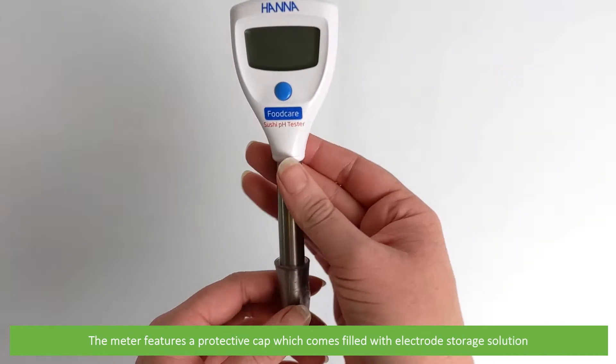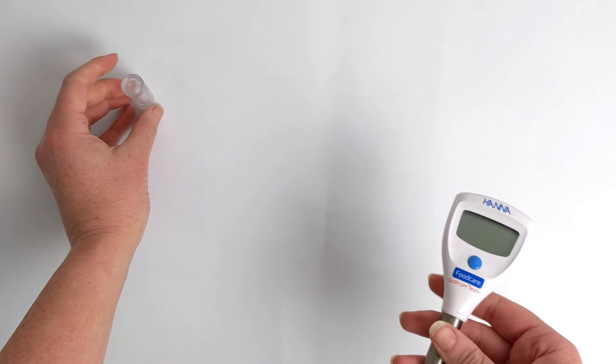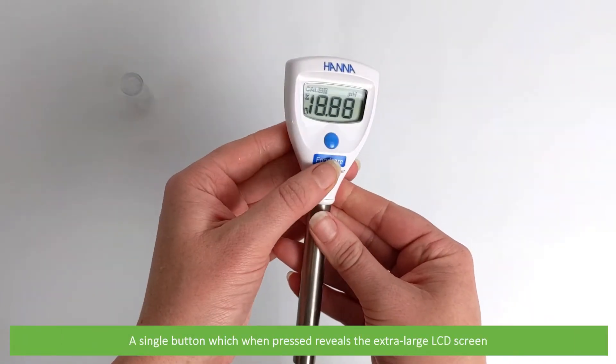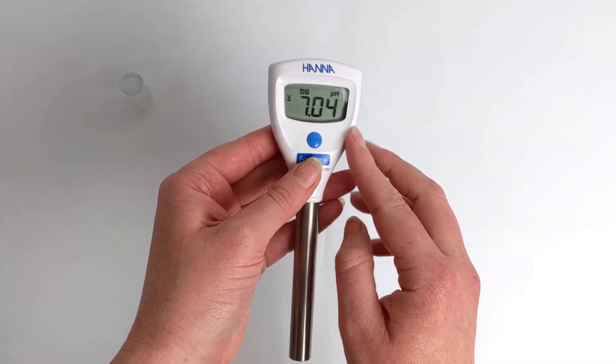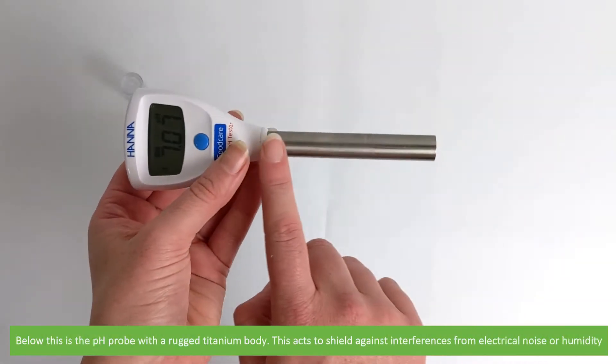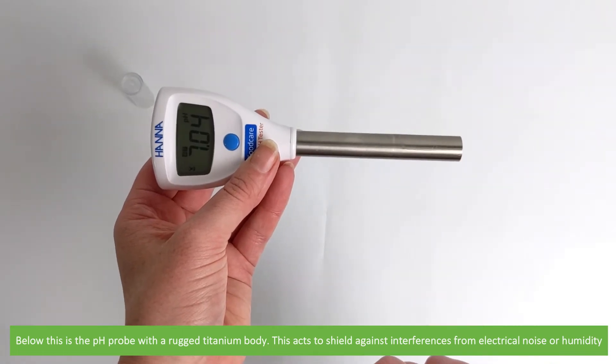The meter features a protective cap which comes filled with electrode storage solution, and a single button which when pressed reveals the extra large LCD screen. Below this is the pH probe with a rugged titanium body, which acts to shield against interferences from electrical noise or humidity.